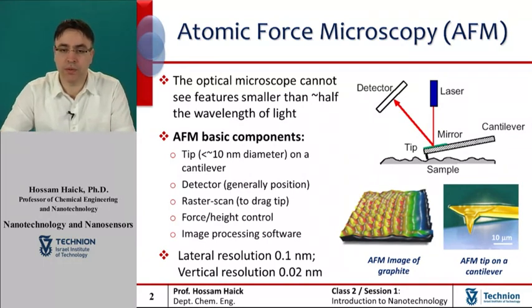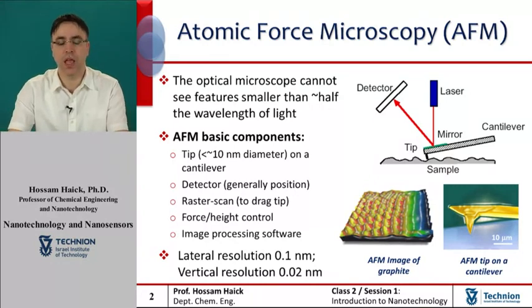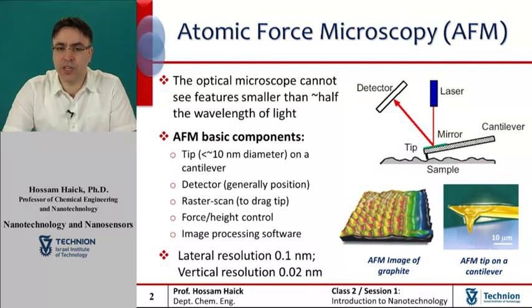Depending on the situation, forces that are measured in AFM include mechanical contact force, van der Waals forces, capillary forces, chemical bonding, electrostatic forces, magnetic forces, solvation forces, etc. Along with force, additional quantities may simultaneously be measured through the use of specialized types of probes. Typically, the deflection is measured using a laser spot reflected from the top surface of the cantilever into an array of photodiodes.